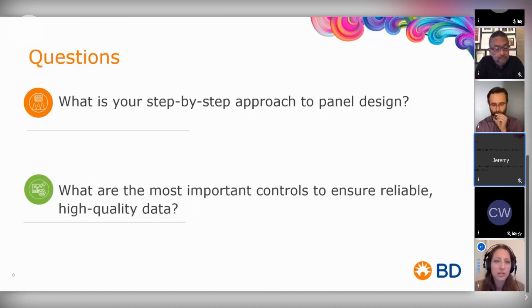What are you trying to find out? What are the important markers? So really define what it is that you want to measure, which markers are necessary to do that, which are important, and which are just plain interesting to add if possible. So you add a little ranking into the markers that you might want to address. And if you have knowledge about co-expression or mutually exclusive markers, that's something good to note.